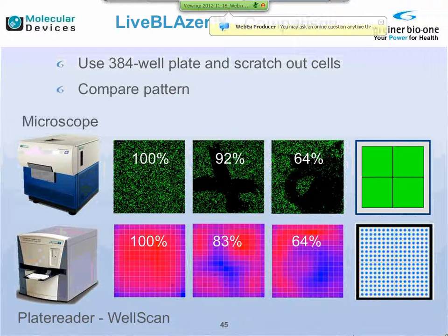Okay. Probably one thing to add is that what we did here is a 14 by 14 data point scan, as you can see on the right-hand side. This data was also further analyzed, or similar studies were done by our colleagues. So if you are interested in such comparison studies, please feel free to contact us and we can provide you the data.